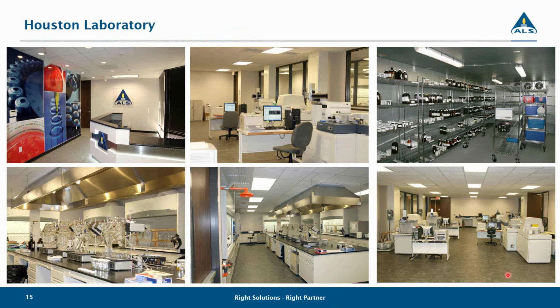Nicole, I do have a question coming in from Catherine. She says, could you repeat the bit about the calculation of the total? I think you said the K flagged values are not included in the total. That is correct. For the total homolog groups, the EMPC values are not included in total homologs, but they are included for TEQ calculation.